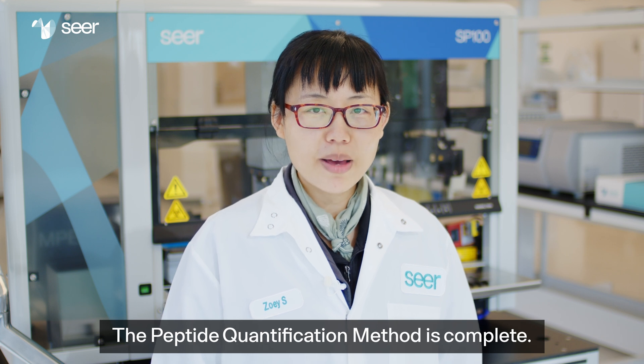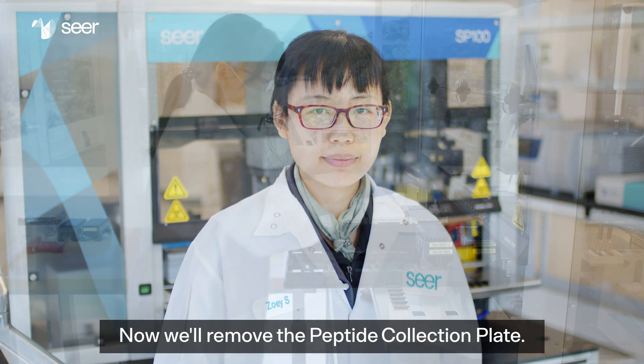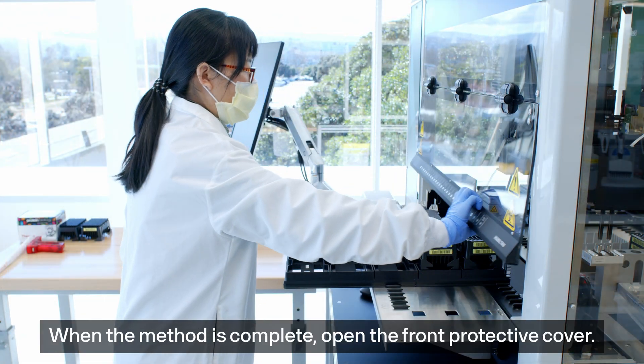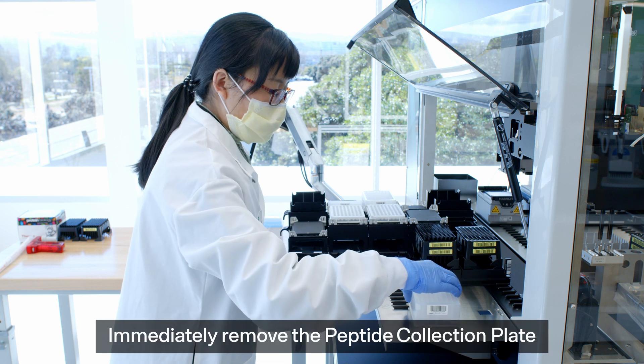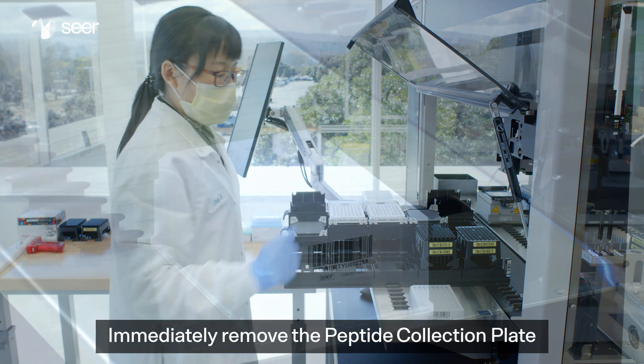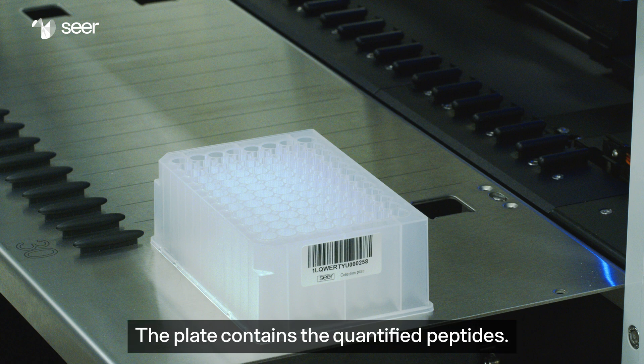The peptide quantification method is complete. Now we'll remove the peptide collection plate. When the method is complete, open the front protective cover. Immediately remove the peptide collection plate from position B5 of plate carrier B. The plate contains the quantified peptides.